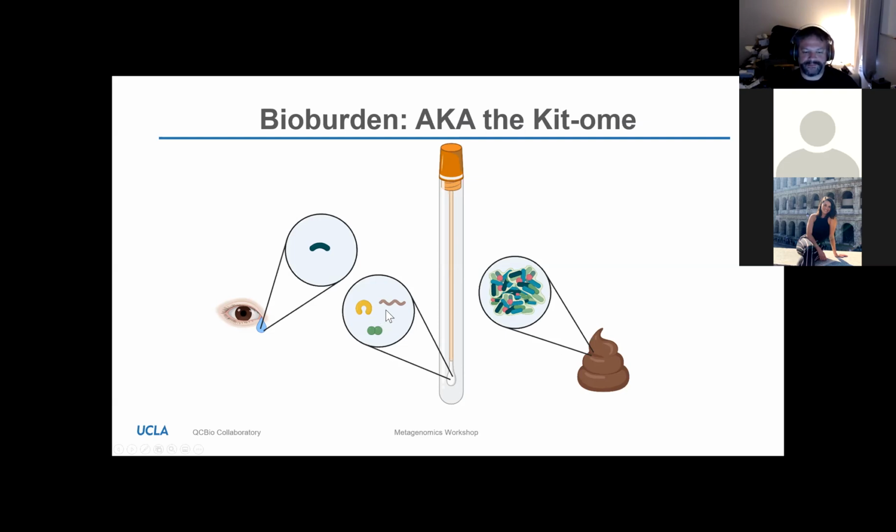If I do, on the other hand, a tear sample, and I've actually seen people testing things like infant tears, tears have extremely low microbial load, especially infant tears. And at that point, as you can see here, I would, for example, get 3 microbe signals from the swab itself, and basically only 1/4 of my signal would be from tears. So I could very easily overwhelm the signal in the tears with signal from just a dirty swab.